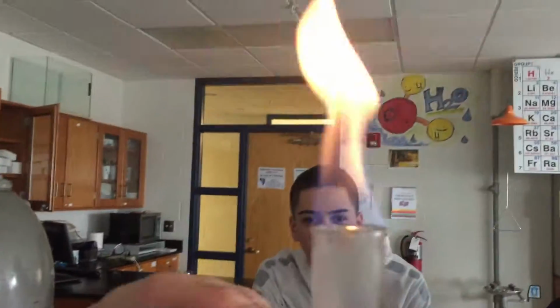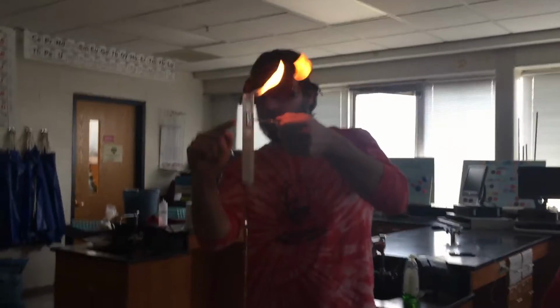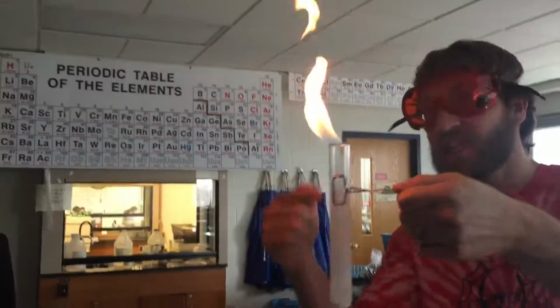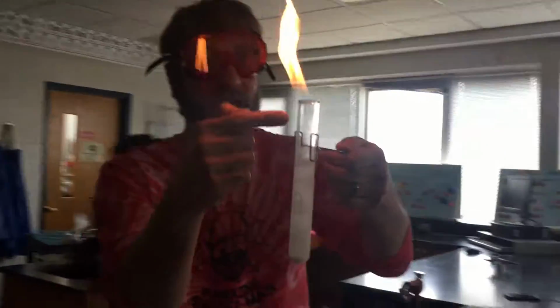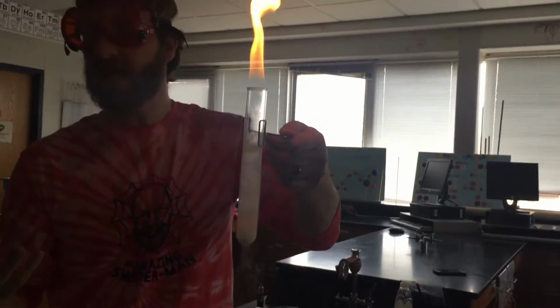Okay, you see the flame? Now the little liquid methane that's in here is boiling because it's being warmed up by the warm room. You don't see any flame on the inside of the tube. Why not? Because there's no oxygen. It's just pure methane in this tube. Until that methane reaches the air and can get some oxygen, we don't get that combustion.